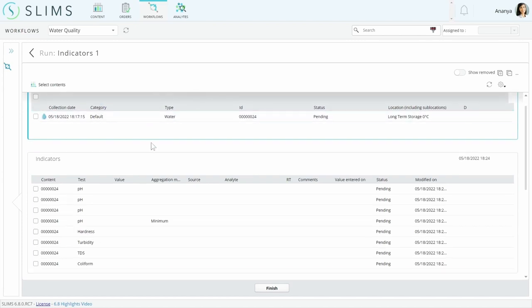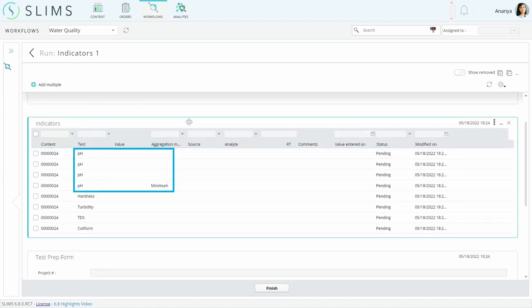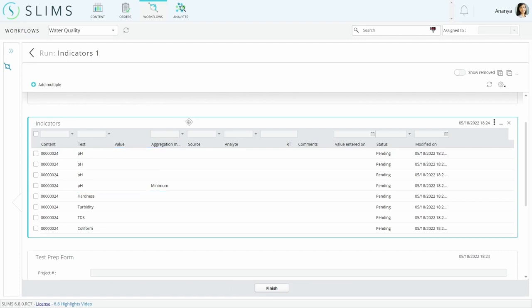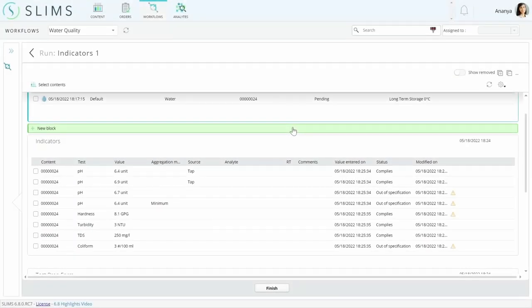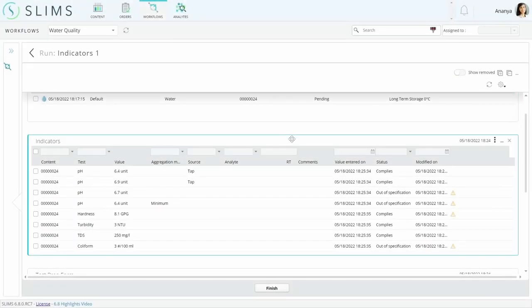This block was set up to request three results for pH and a minimum aggregated result over those three, as well as hardness, turbidity, total dissolved solids, and coliform. These were all automatically created for each of the linked content according to the product specifications.